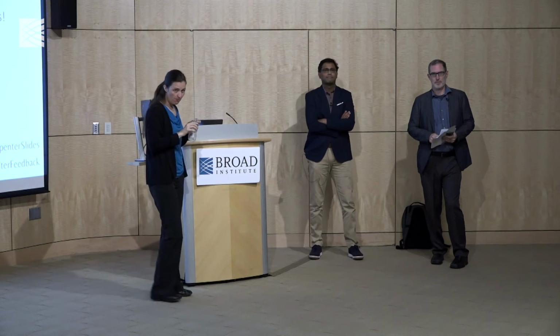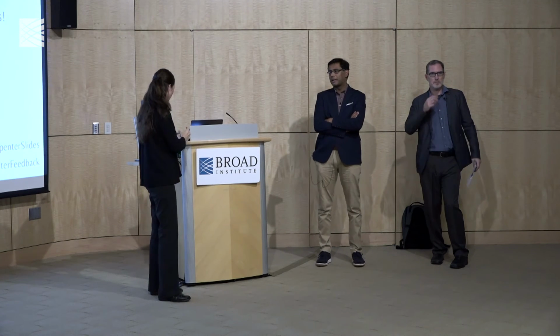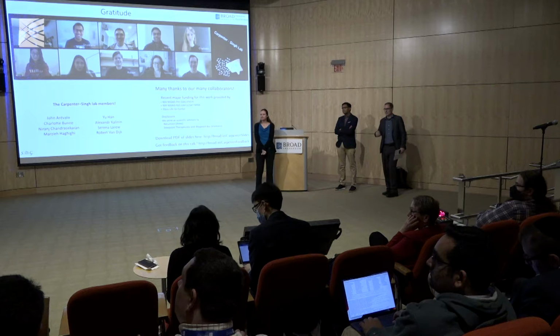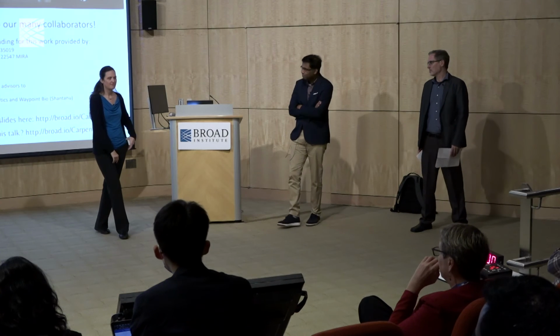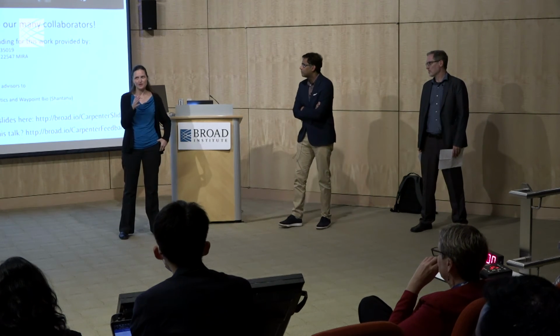Pat? Yeah, I guess my question relates more to classification versus regression. So you've shown a lot of great examples where you can classify cells. But what if I'm working on a drug discovery program and I want to improve the molecule, right? So I'm not going to completely flip the phenotype, but can I, through image analysis, capture improvements that are sort of taking me on the road to the phenotype? Yeah, for sure. Most of these morphological phenotypes are continuous.